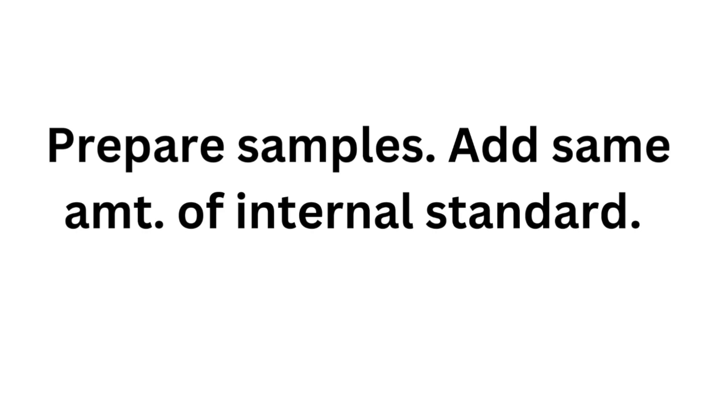And here you prepare the samples under investigation, adding the same amount of internal standard to each sample as was added to the standards. And then you go on to your analytical measurement where you analyze both the standard solutions and the samples using an appropriate analytical method such as HPLC, GCMS, or LCMS.